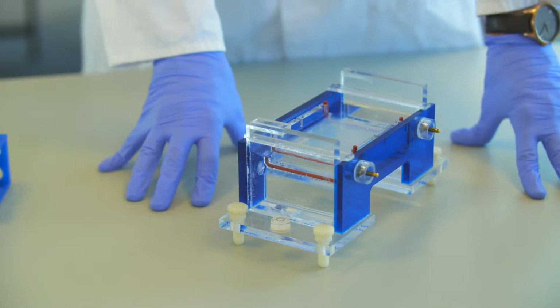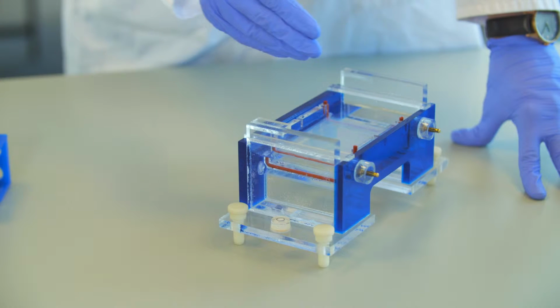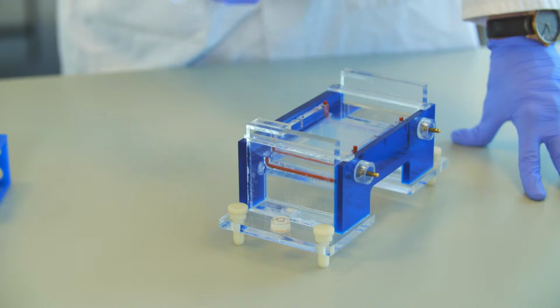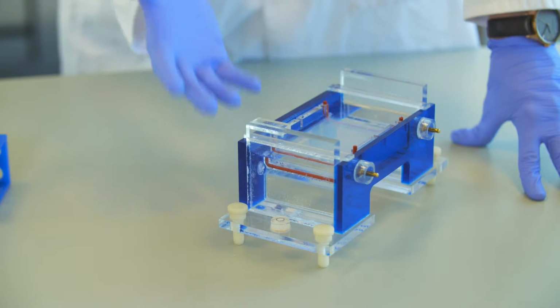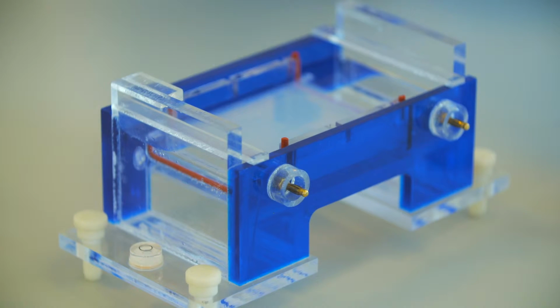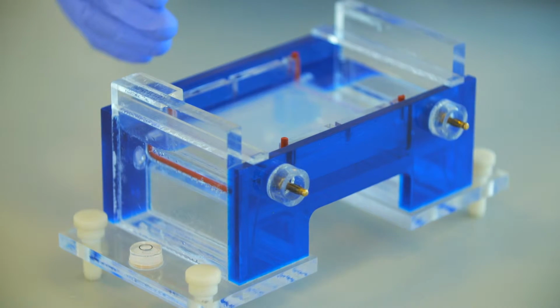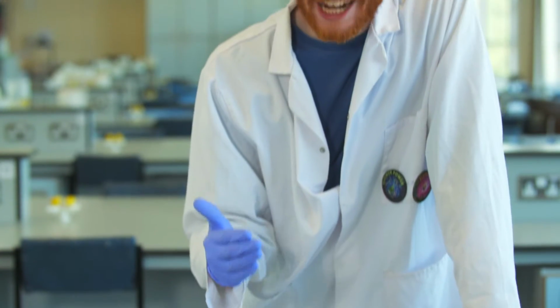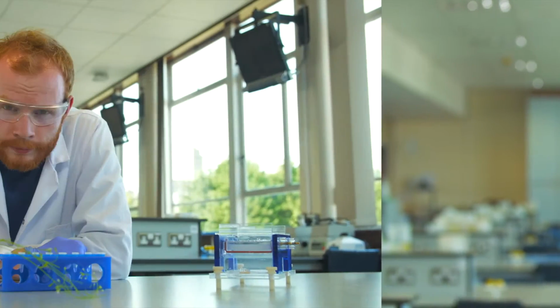So for electrophoresis, I have the following equipment. I have a gel made of agarose with small wells at one end. The gel is sat in a tank surrounded by a special buffer solution, and an electric current can be passed through our gel in order to separate charged substances. Here we're separating DNA, which is negatively charged and so should migrate from the negative electrode towards the positive electrode.